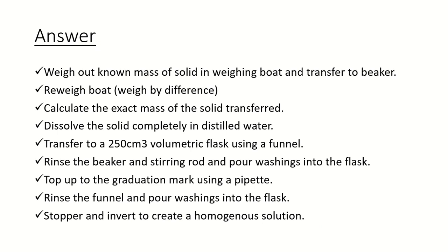So, again, basically the whole method, but simplified a little bit. We're going to weigh out a known mass of the solid in the weighing boat and transfer this to our beaker. We're going to reweigh the weighing boat, aka weigh by difference. This is going to allow us to actually calculate the exact mass of the solid that is transferred. Next, we're going to dissolve the solid completely in distilled water. I'm going to stir this again with a stirring rod, might want to include that.